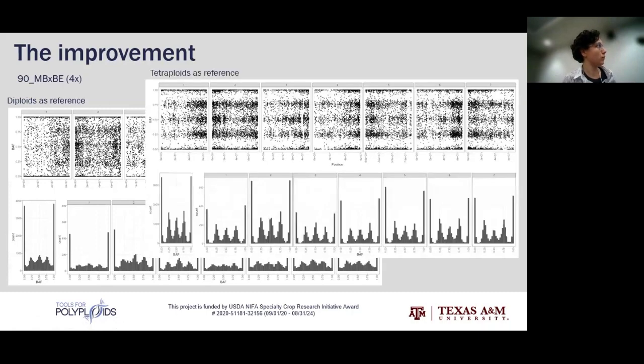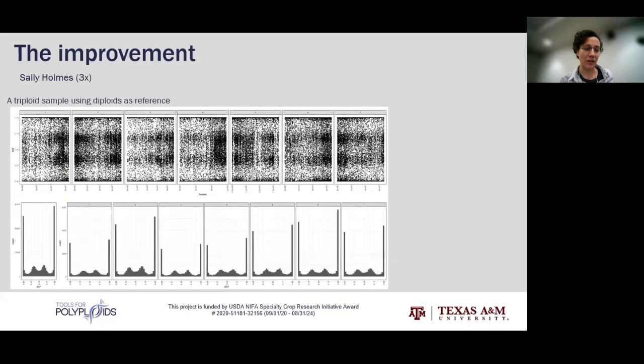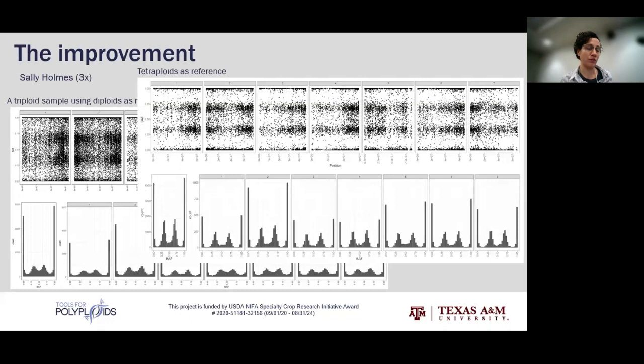It's good, but it's much better if we use tetraploids as reference, because we have more samples and more references too. So yes, closer to the human graphics. I was happy. And it also works for triploids pretty well, using tetraploids as reference.